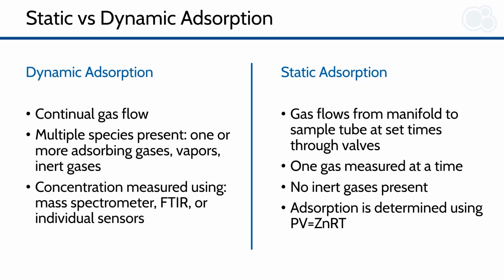So next I'd like to talk a little bit about some of the differences between dynamic systems and static adsorption systems. A dynamic system, as I've talked about previously, is something like breakthrough analysis, whereas static adsorption is something that you might use in a 3Flex or a TriStar or another instrument that we sell.